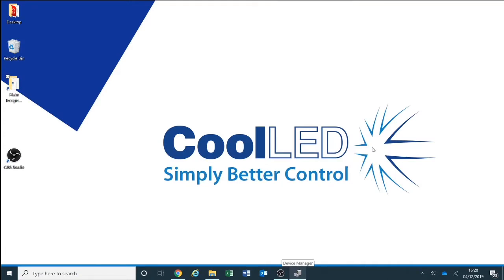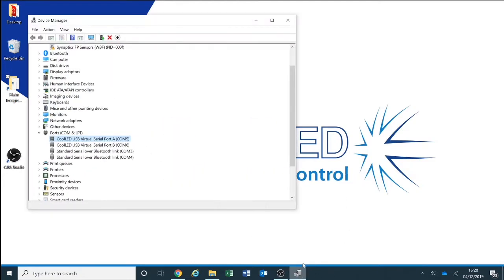You can then connect your pE-4000 light source to the USB port of your computer. Then head to Device Manager to check that your light source is being correctly recognized by the PC. If it is not displayed as this, you will need to right-click on the device and click Update Driver, pointing the computer to the location in which you just saved the downloaded driver.